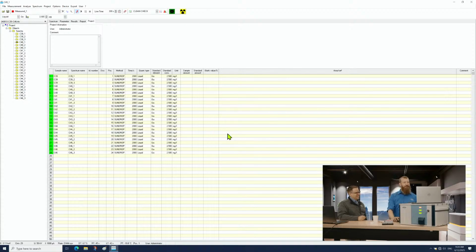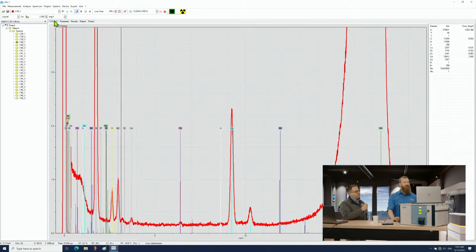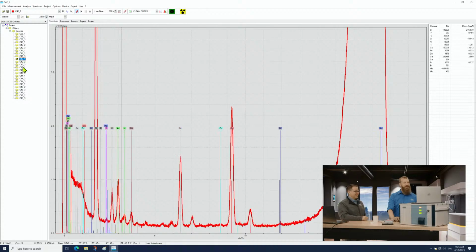And I tested a bunch of them. Could you tell us all the flavors in the Dr Pepper? Yeah. So let me find a couple where bromine came out.